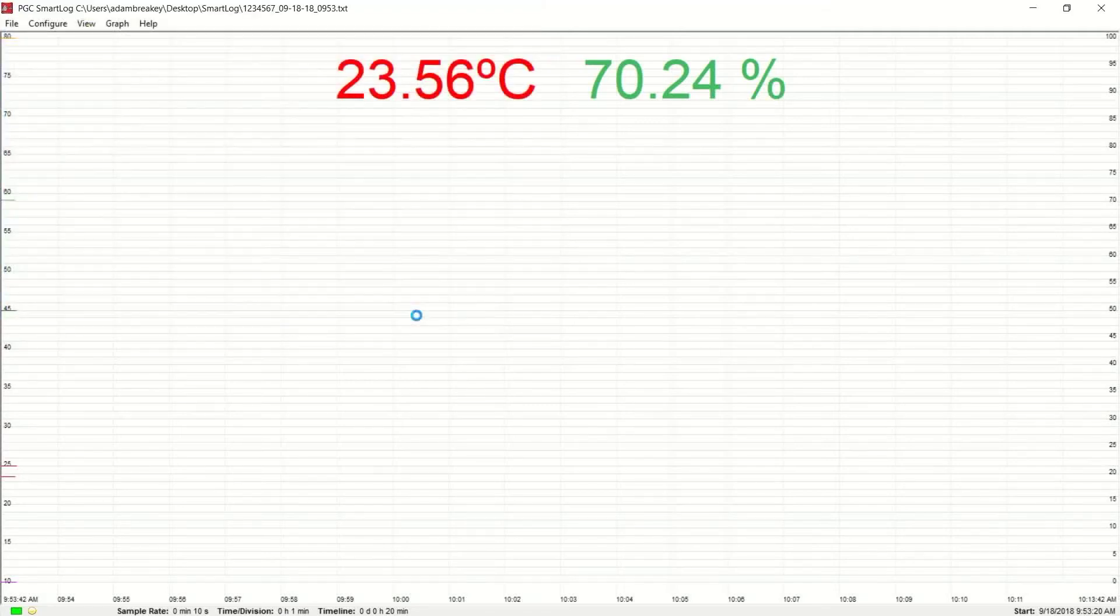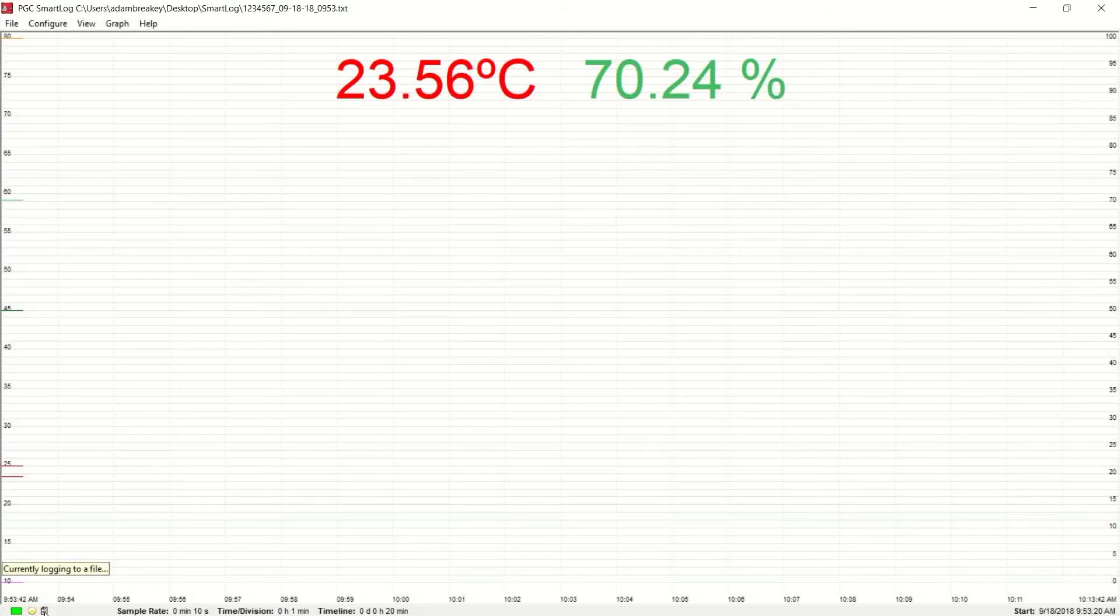The icon indicating that your parameter conditioner is actively logging to a file will appear in the lower left-hand corner of your screen.